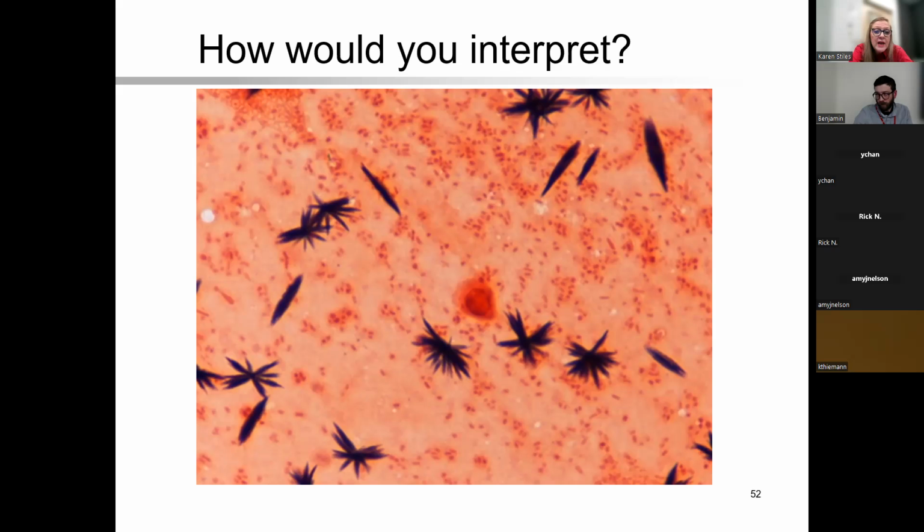On the other hand, you have to be ultimately careful about whether they're truly mixed in with a second organism. That's where it takes going through the slide a good 25 fields and making sure that what you're seeing is either truly different or maybe just coincidentally that same Haemophilus influenzae. So good point.